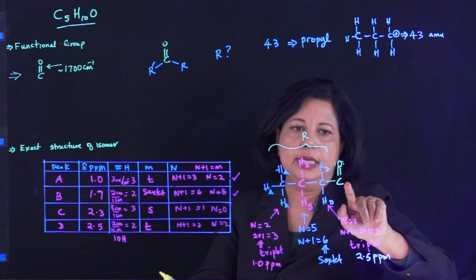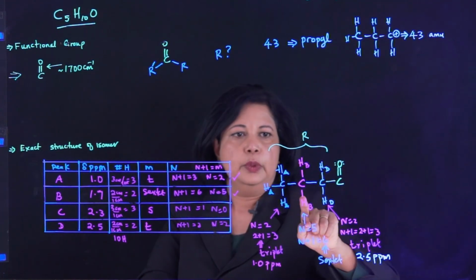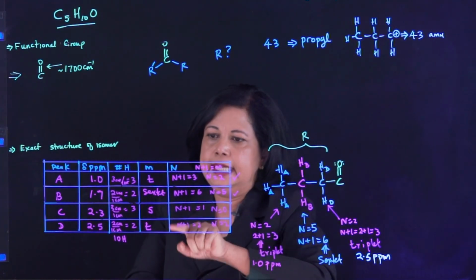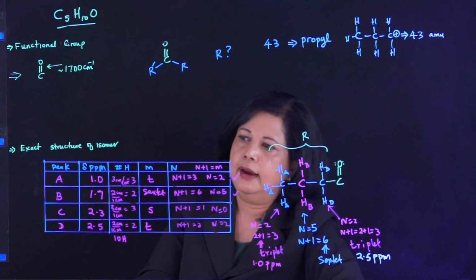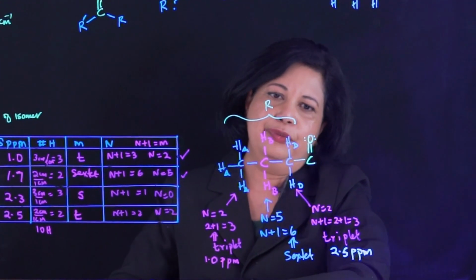As you can see, you need something else to fill the valence. Oh, well, we took care of A, B, and D, so there's only C left, and C is a singlet, no hydrogens. And on that singlet, you have 3 hydrogens. So there's only one possibility for that.